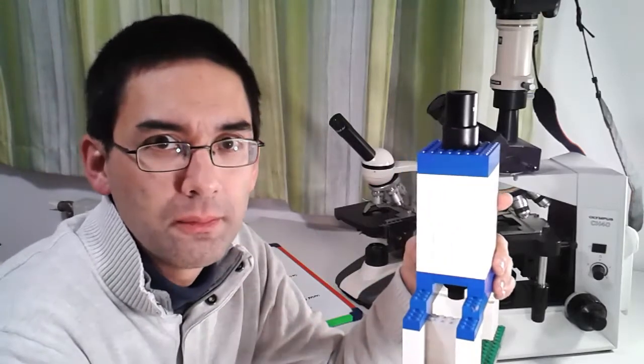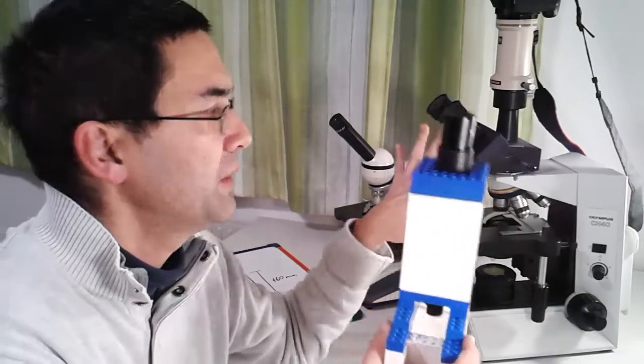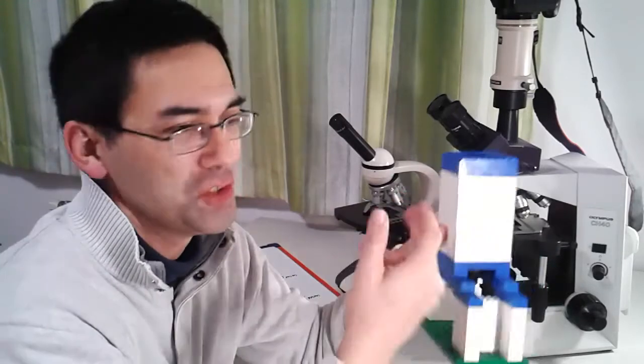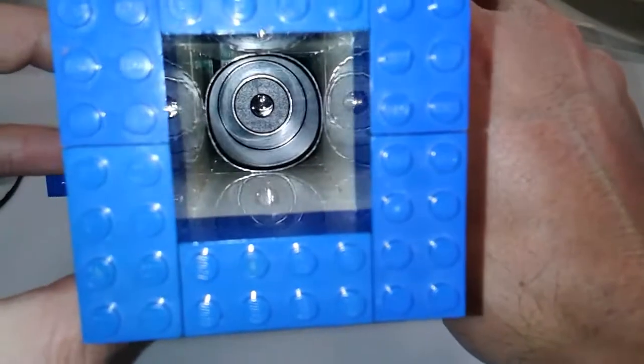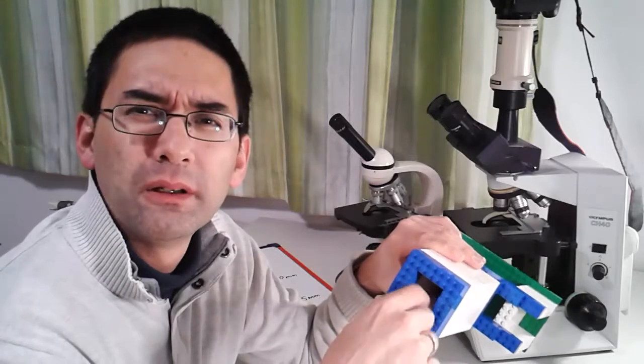You can do the fine focus by moving the eyepiece up and down. Once you've got the focus, I would just probably leave it as it is and then simply look at different slides. Now, the contrast that this microscope delivers is not quite as high as other microscopes — it looks a little too bright. One of the reasons is that the sides of the plastic here are shiny and white, so there's a lot of internal light reflection. What you might want to try is putting some black paper in here to absorb the light. Even black Lego pieces are shiny and reflect light, so rough black paper which absorbs the light should give you a slightly better contrast.